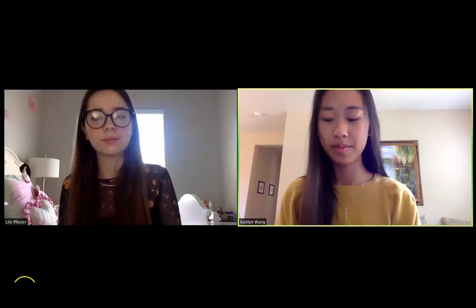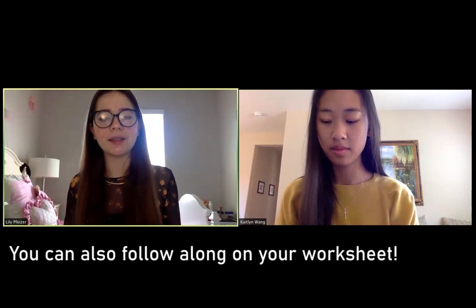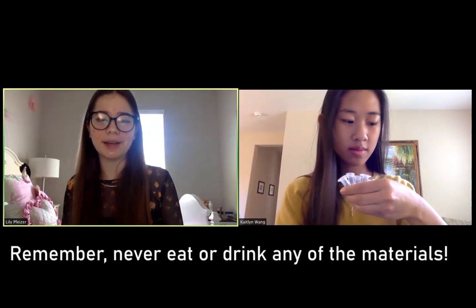In the next portion of this video, Kaitlyn and Lily are going to guide you through the experiment. Make sure you gather all your materials and listen carefully. From the materials list, gather all of your supplies and keep all 6 of the test tubes closed until you're ready to begin.